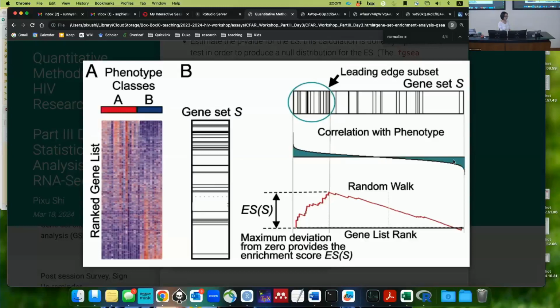Okay. I'm asking that because I have a data set. I did some RNA sequencing but I didn't run any replicates, and I was just curious if I could follow this. So I basically ran one sample per condition instead of 2 or 4 like you had here. Oh, I don't think you are able to run DESeq. I looked into it, and if you don't have replicates, you cannot. You don't have enough degrees of freedom to estimate the parameters.